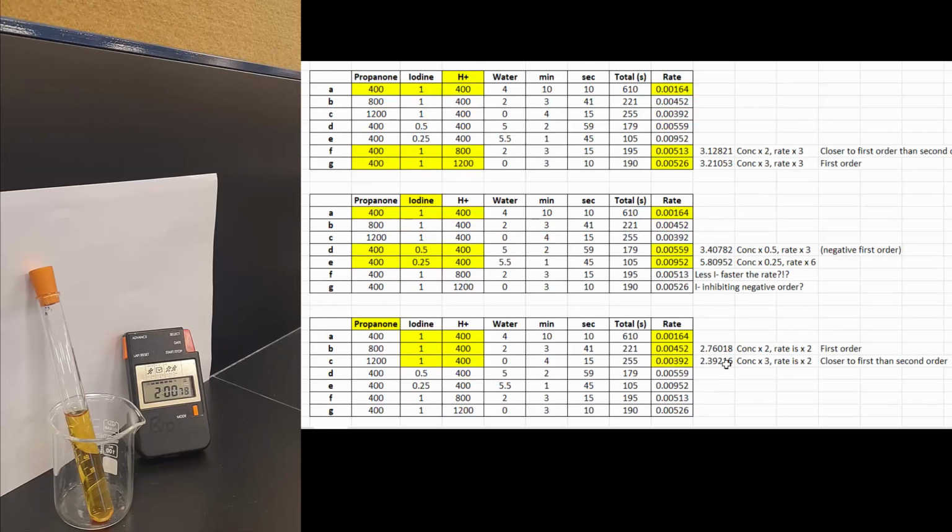So just checking the data because I didn't expect it. This one's expected to be 0 order, and we're getting an inhibition, a -1 order. So a colleague's data did a much better job because they graphed it. So you can see it'd be even better to do a range of 5 to repeat it. And so they're getting concentration versus rate, so first order for the other two. They didn't call that as 0. It should be a flat line, but it is the same results. They are getting -1 as well.